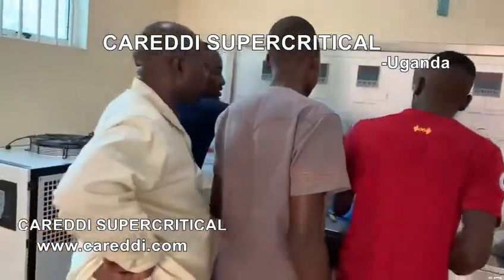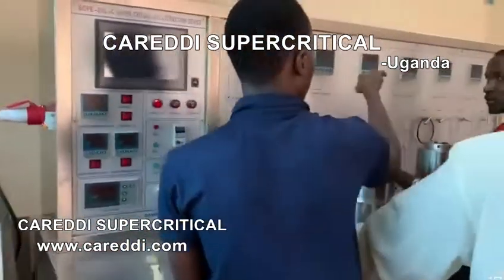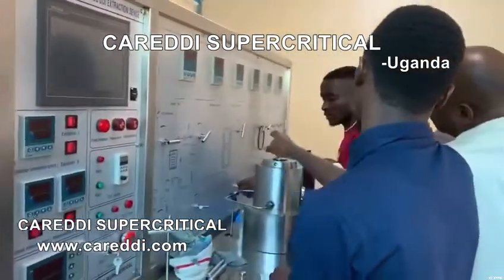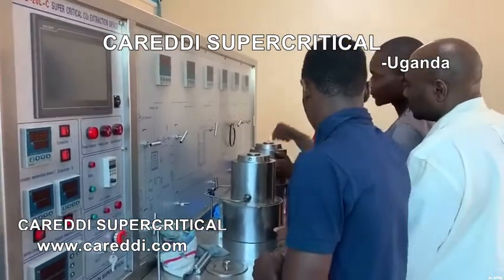This one will be closed. Yes, it will be closed. So after opening and closing, the next stage — the pressure is still high. You have to increase it further.